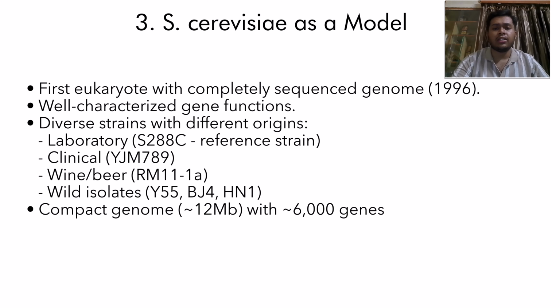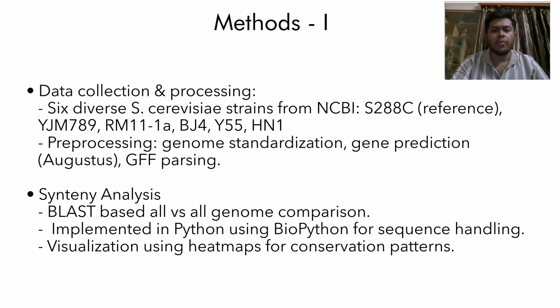This diversity makes Saccharomyces cerevisiae an excellent model for studying the genetic basis of adaptation and the relationship between genotype and phenotype. Now let me walk you through our methodology in detail, explaining the key components of our pipeline and the tools and approaches we have implemented.